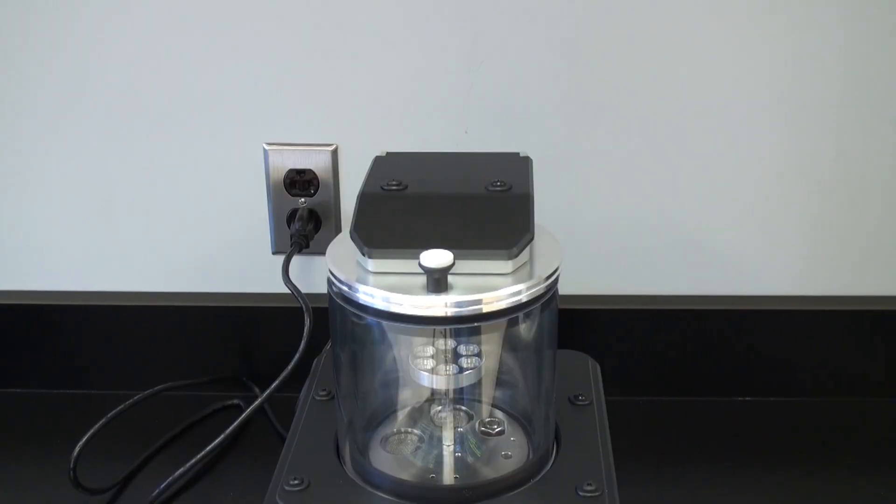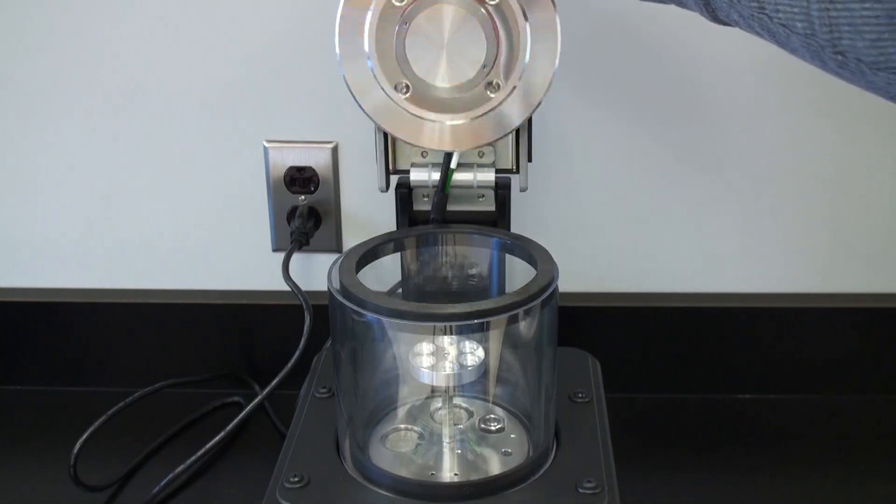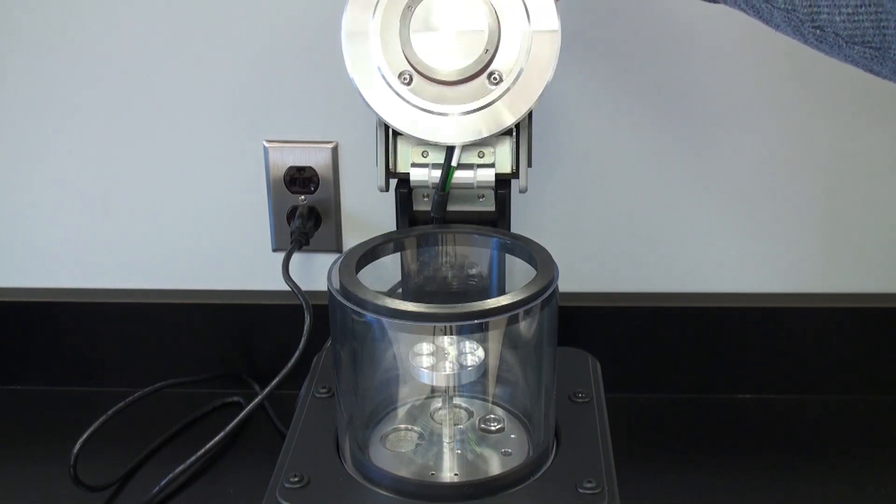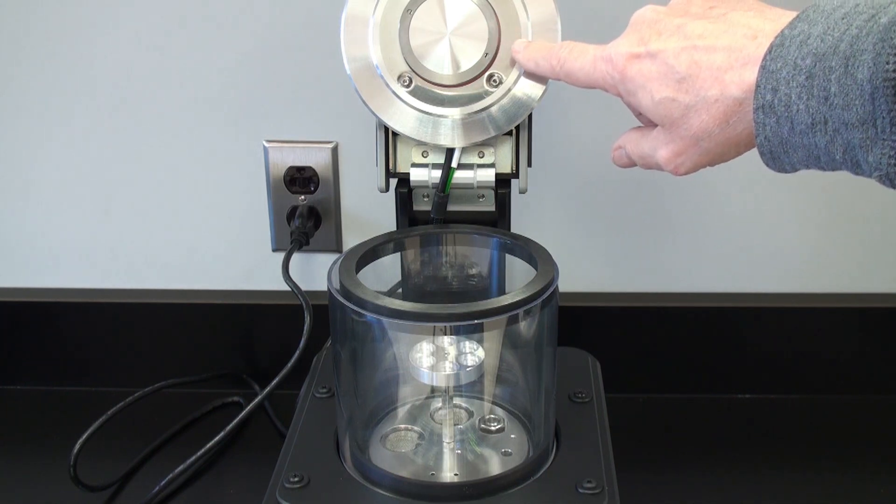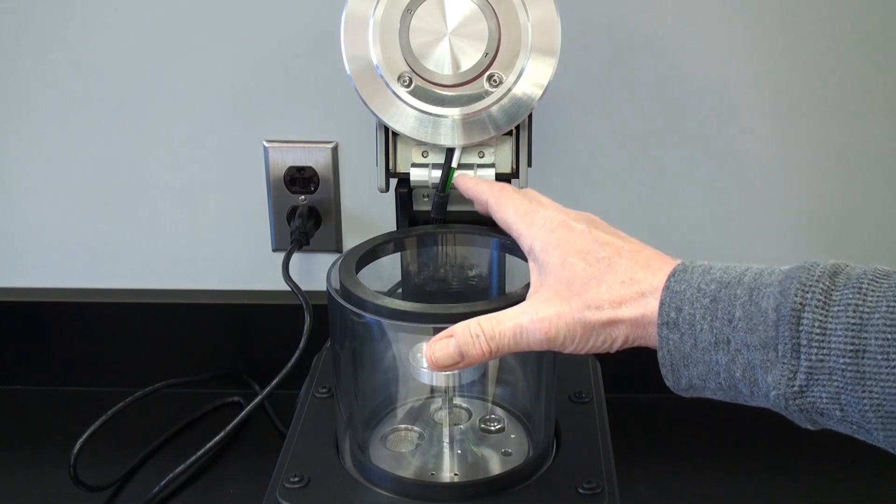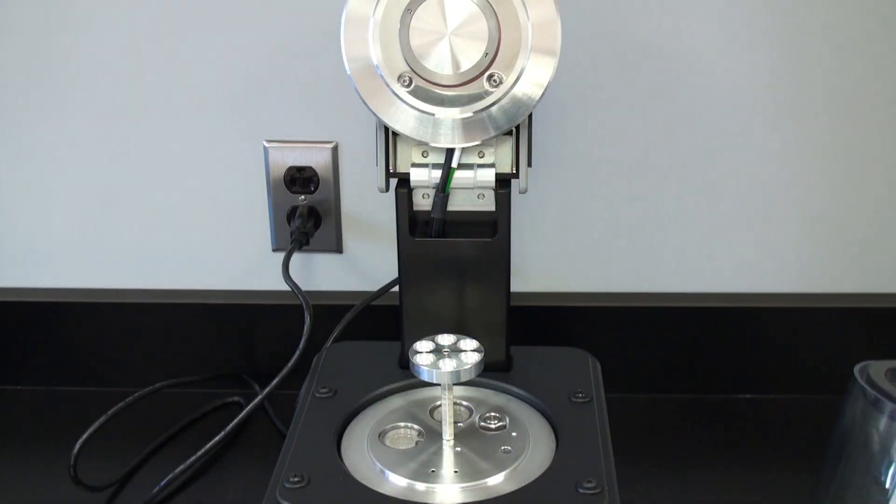When the system is vented in an atmosphere, the chamber is easily accessed by lifting the lid, exposing the sputter head where the sputter target belongs. The glass cylinder and implosion guard can easily be dismounted. There is a fixed stage at a particular height which is optimized for this particular instrument.